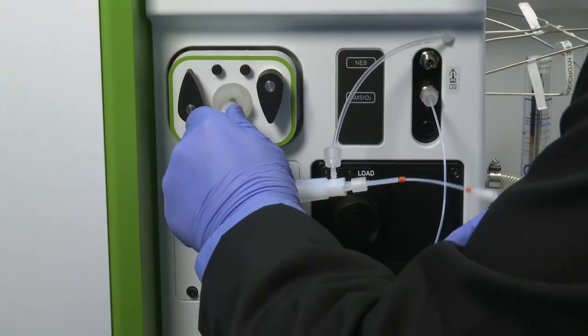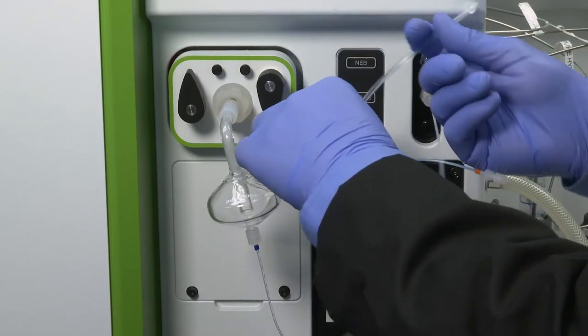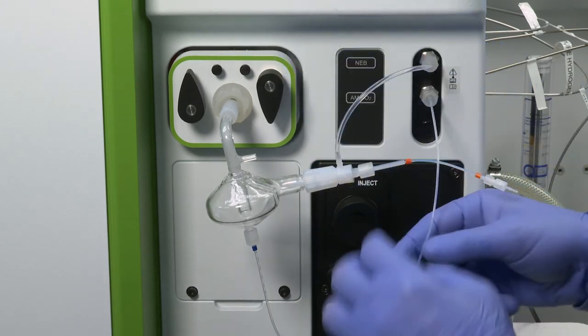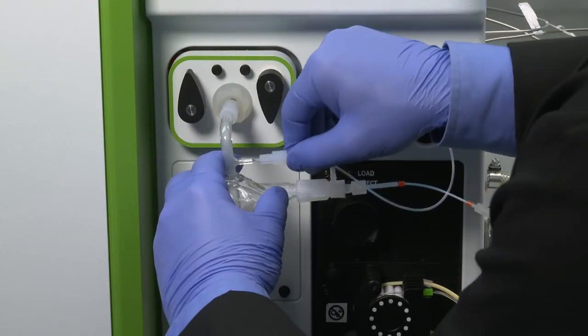Now replace the spray chamber and nebulizer assembly by pressing the spray chamber directly onto the injector base. The instrument is now ready for use.